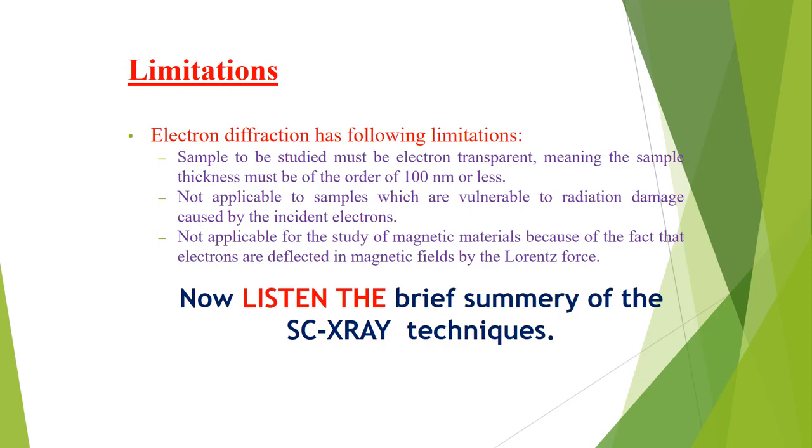Single crystal X-ray diffraction includes two physical processes. Number one is scattering of X-rays by matter. Number two is interference of those scattered X-rays to produce a diffraction pattern.